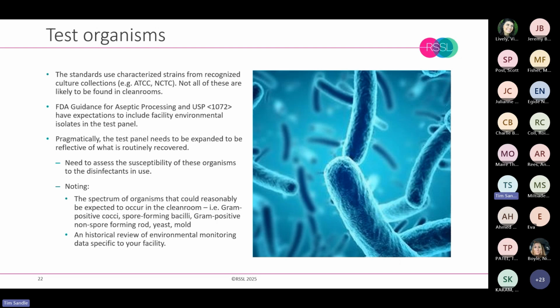finding within the facility. So if you take the fact that Micrococcus luteus is generally, according to most surveys, the universally most common organism, that probably should be included. Now, some may make the argument that Staphylococcus is very similar, and to a degree it is, but Micrococcus luteus's ability to survive for prolonged periods in the clean room is almost unique. It certainly is one of the hardiest non-spore forming organisms. So what's the panel going to be made of is a key choice.